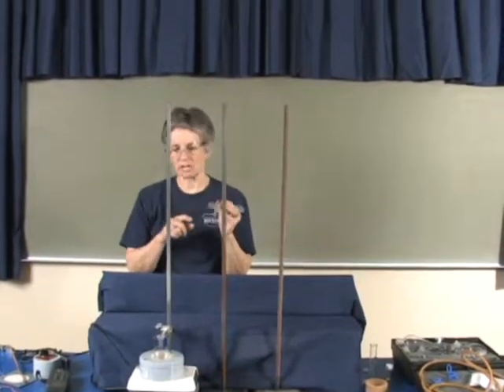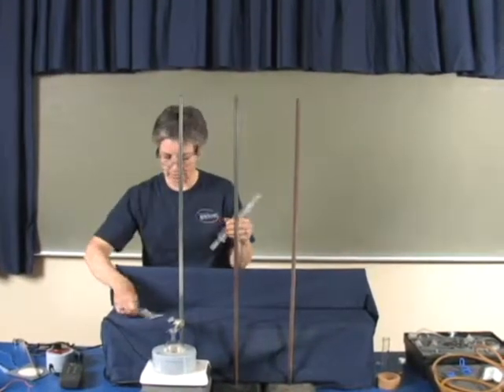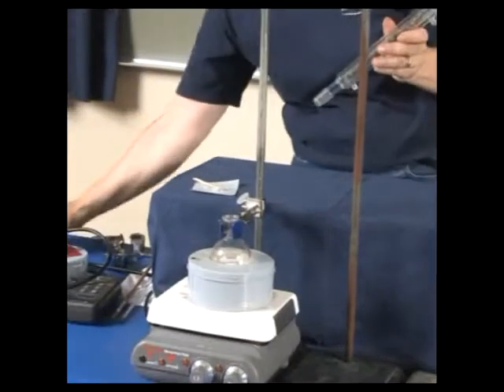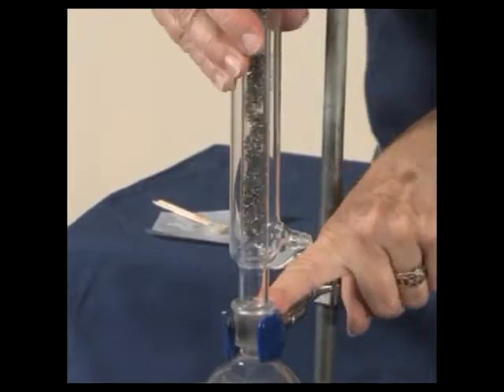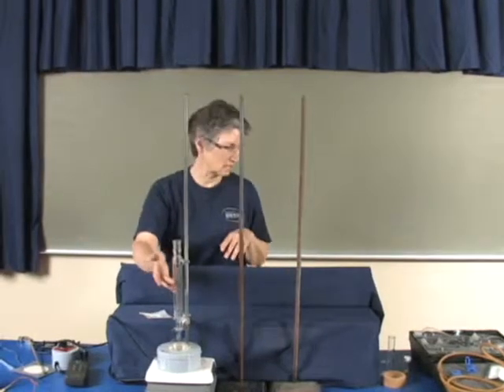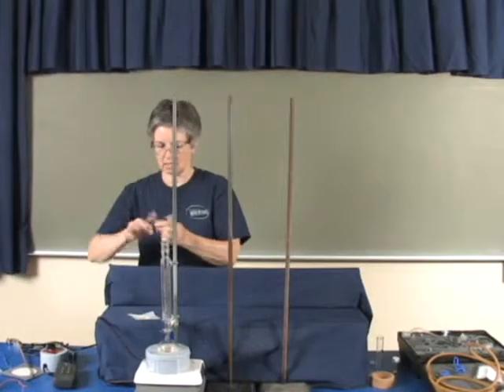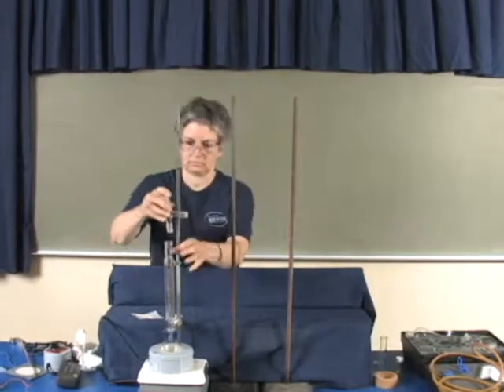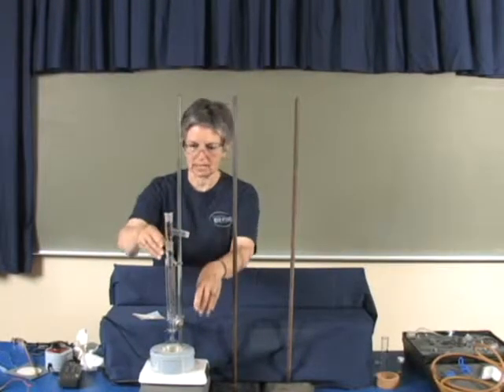Then when you assemble the ground glass condenser to the flask and any other joint, you have to put a little bit of grease on the outside of the piece that goes inside the second piece so that they won't fuse together. Once greased, it turns translucent, and when you twist it, you should not hear glass grinding against glass. Fractionating column goes in next. Then the distillation head. Twist, it should look translucent when you have the grease properly applied.